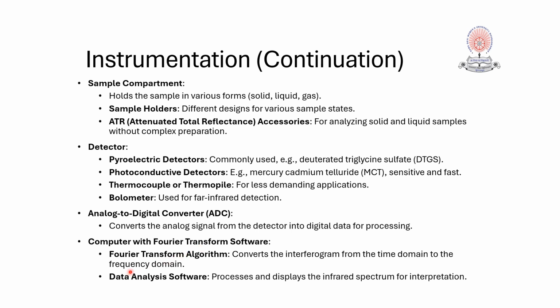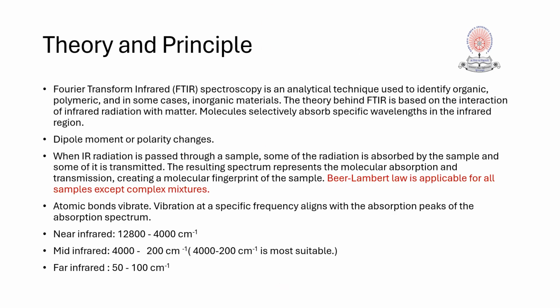Computer is with a Fourier transform software. The Fourier transform algorithm converts the interferogram from the time domain to the frequency domain. Then there is data analysis software to process the data and for displaying the infrared spectrum for interpretation.